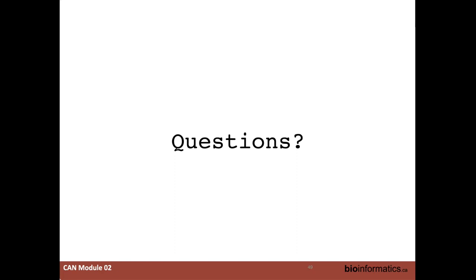I highly recommend just open it up and take a peek. It costs you a couple seconds just to review it, and it also gives you some idea about familiarity. So that whole idea of using the quality scores when you're doing your base calling, as well as when you're doing your variant calling, not all algorithms actually look at it, which is the sad part. Some of them do, some of them don't.